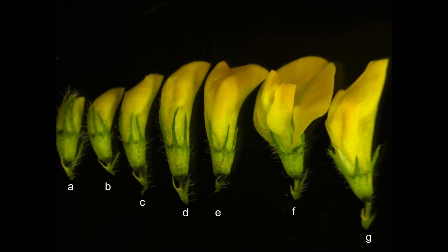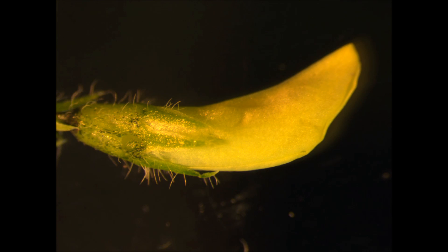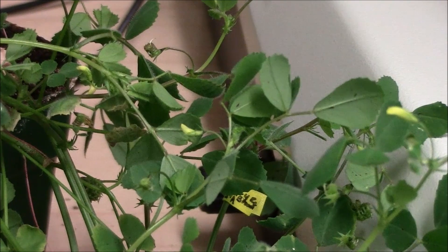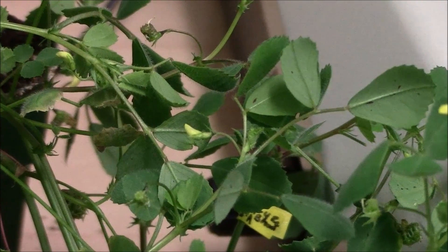Here you can see Medicago truncatula flowers from various developmental stages. Among all flowers, select the optimal flower bud to serve as a female because it is neither immature nor too old. Immature flowers may not be ready for pollination, whereas in flowers that are too old the anthers might have already ruptured and self-pollinated the flower. In this plant, let us go ahead and select the flower bud in the middle as a female to perform anther removal and artificial cross-pollination.